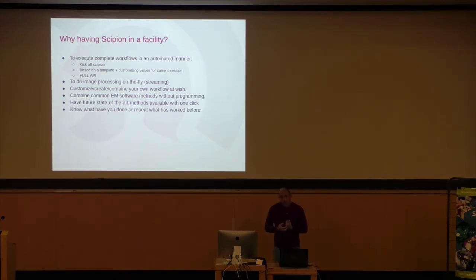So these are a few reasons we think Scipion will help you in the facility. It will help you to execute complete workflows in an automated manner. As I said, you can have templates. You can have even your own script if you have some Python developer close to you. So you can decide which workflow you want to run, and you can kick this off every session, and you have your custom workflow running every day.